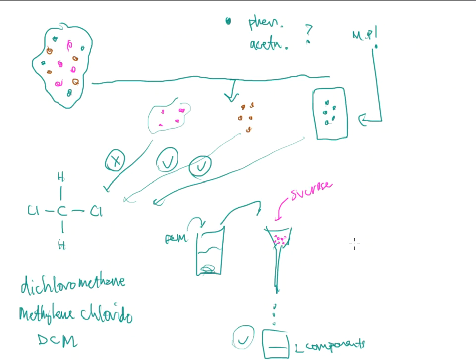So I will take that solid and I will dry it. When I let it dry, I evaporate all the water off of it to get rid of the weight. And then I'm going to weigh the amount of sugar that I have collected. That weight, depending on my starting weight, I can use to calculate a percentage, and then I can report that percentage to see if it's correct.